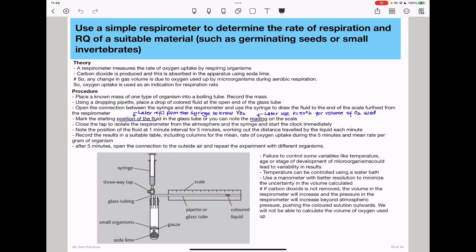After five minutes, open the connection to the outside air and repeat the experiment with different organisms.